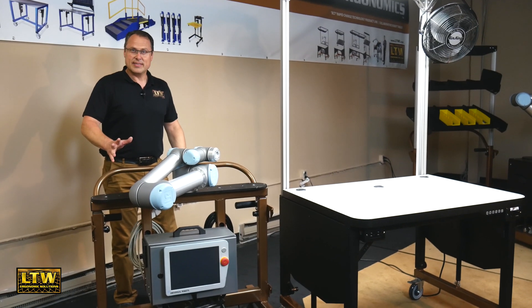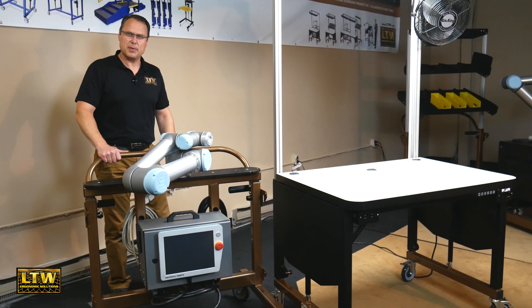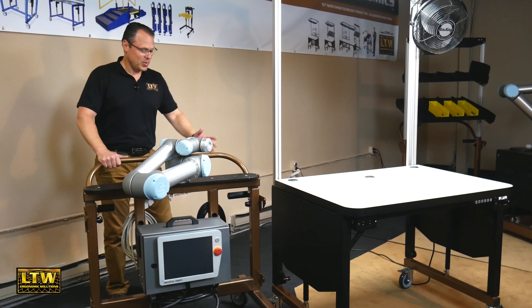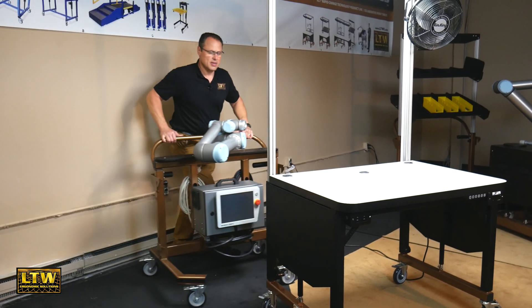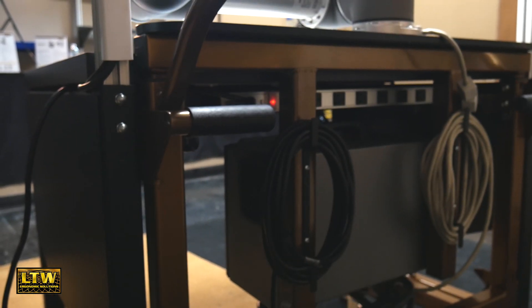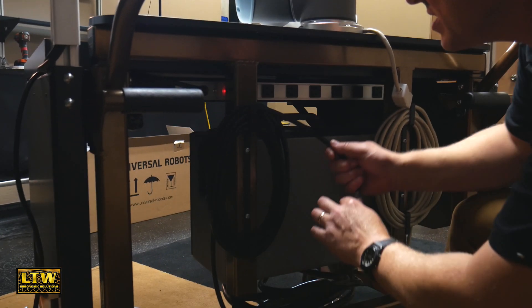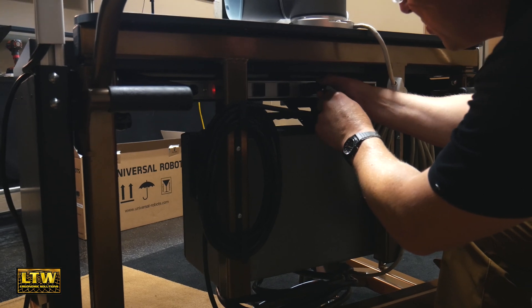That was easy. Now that we have the universal robot all mounted up to the LTW RCT workstation trolley, we can simply go ahead and dock it right into the back side of our workstation. We have a power strip right on the back of our RCT workstation that you can just go ahead and plug in your robot.